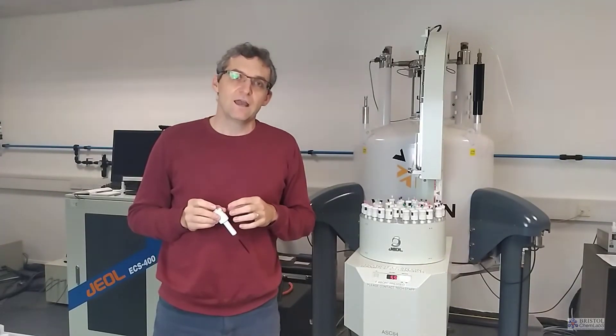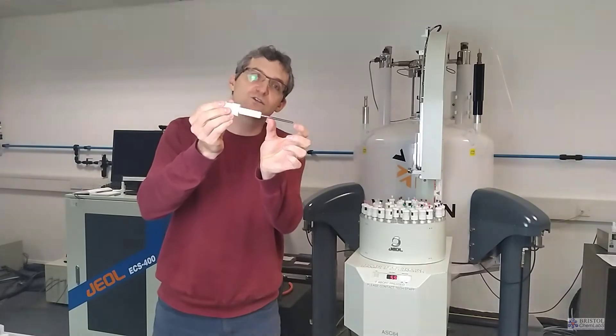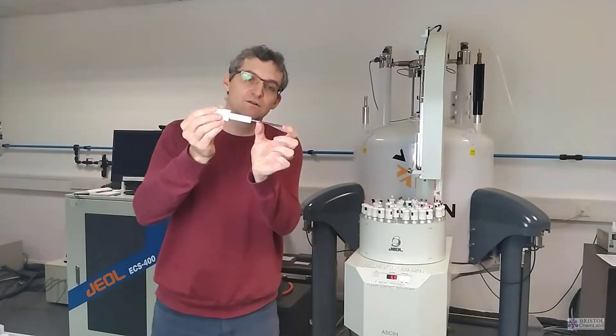I said that NMR magnets are expensive and it costs a lot to keep them running. Even the solvent that we use in NMR is extremely expensive. When we run an NMR sample and we're looking at the hydrogen nucleus, because we've got so much solvent in our sample, we would see a massive signal from the hydrogen in our solvent.